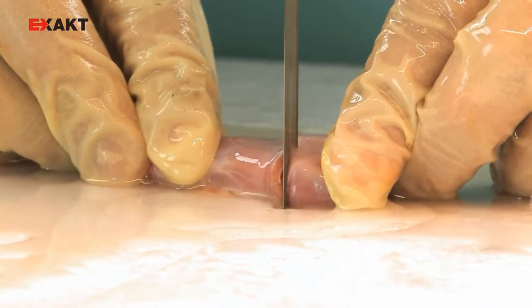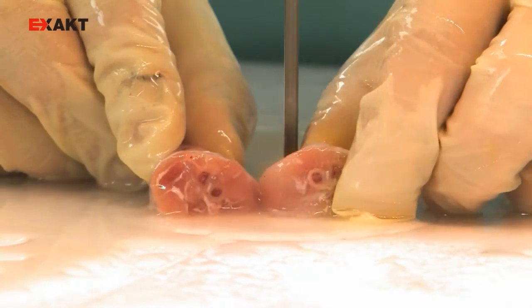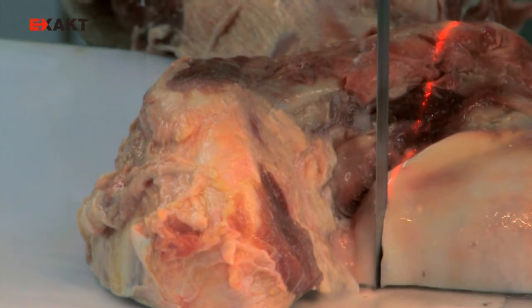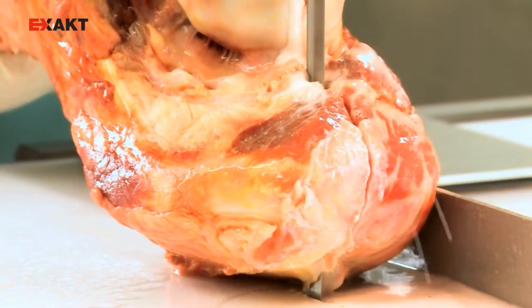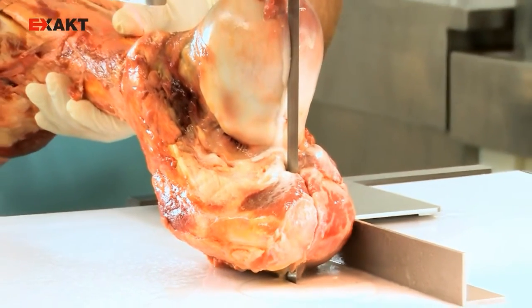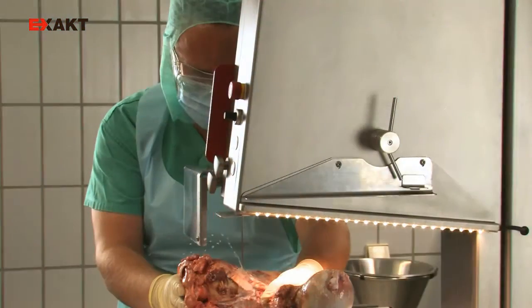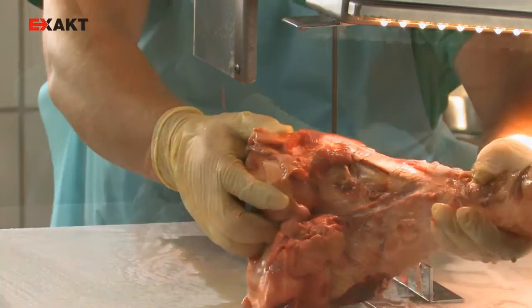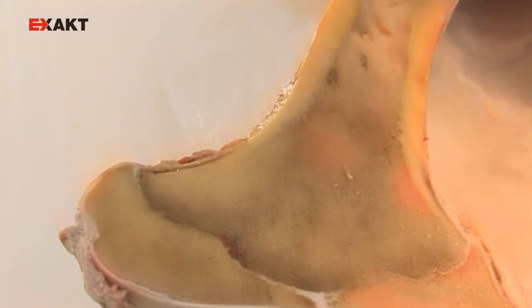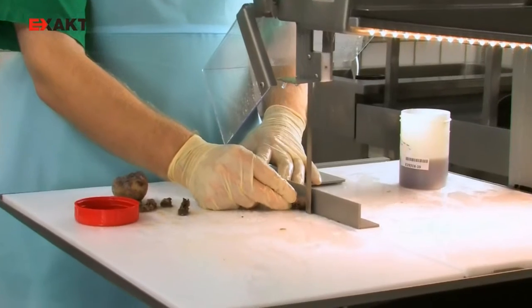Flawless surfaces can be achieved even in the case of uneven tissue densities such as muscle, bone, or implants. The cut is easy to control, clean, and very quiet. The loss of material is very slight, and all cell information is completely preserved.